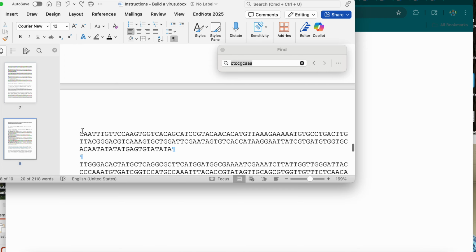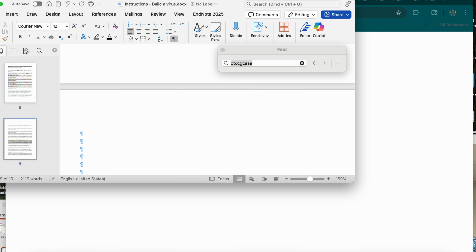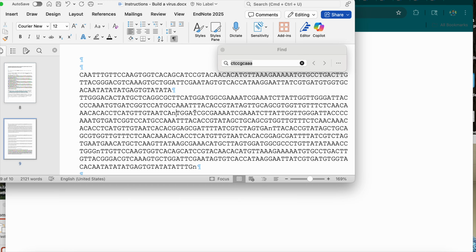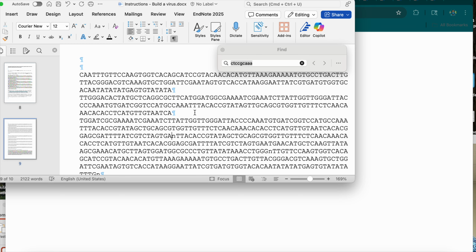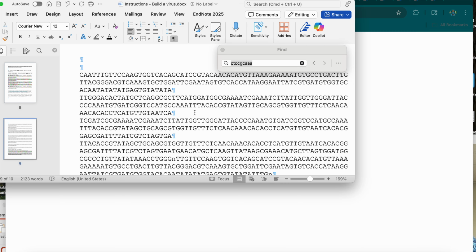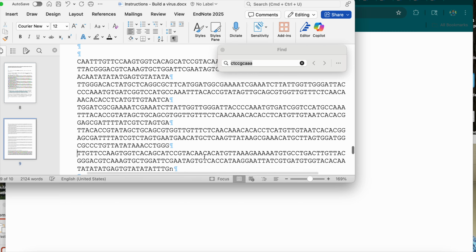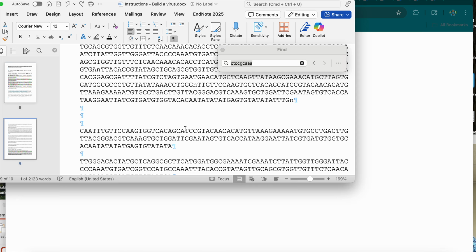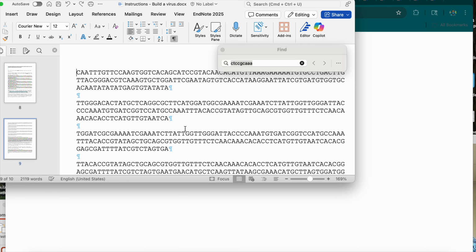Paste. And then everywhere there's a lowercase n, you just delete that and hit return, and they'll all be lined up because they're all 150 apart. And there we go. That's what I've done, and so now we can undo that because I don't need this.